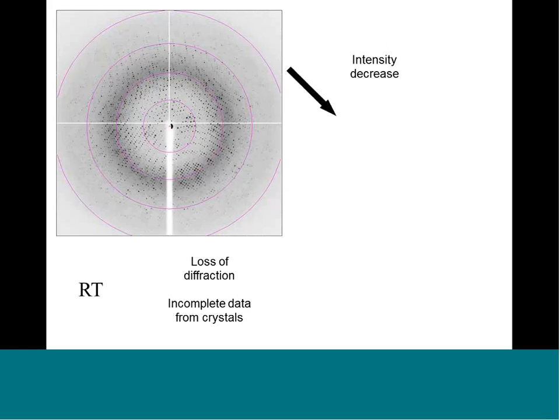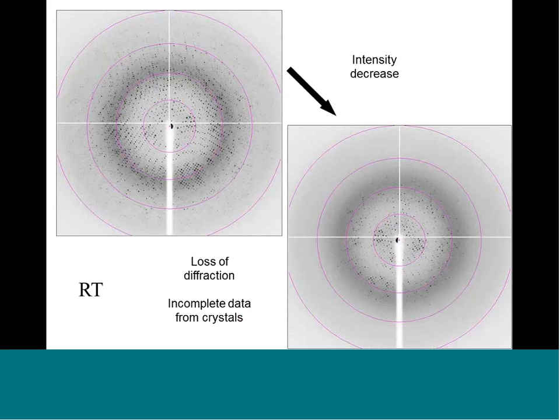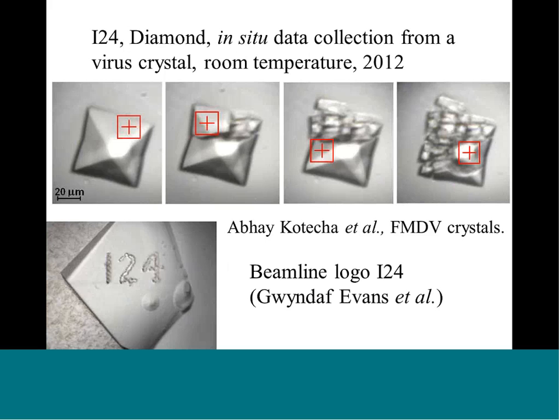At room temperature, we get a nice diffraction pattern at the beginning of our experiment. Within one dataset, or sometimes within three images, we see a loss of diffraction — we lose first the high resolution data at the edge of the image plate, and the other reflections will extend and the mosaicity will increase as the experiment proceeds. This nice picture was taken on I24, the microfocus beamline at Diamond, on a Foot-and-Mouth disease virus crystal from David Stewart's group.